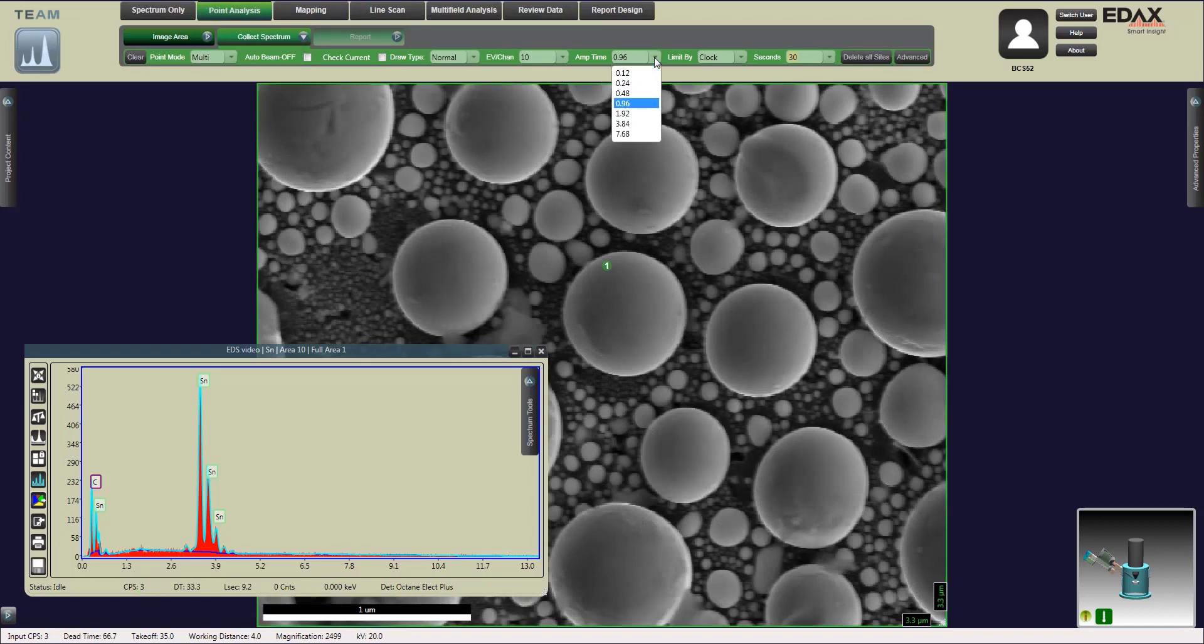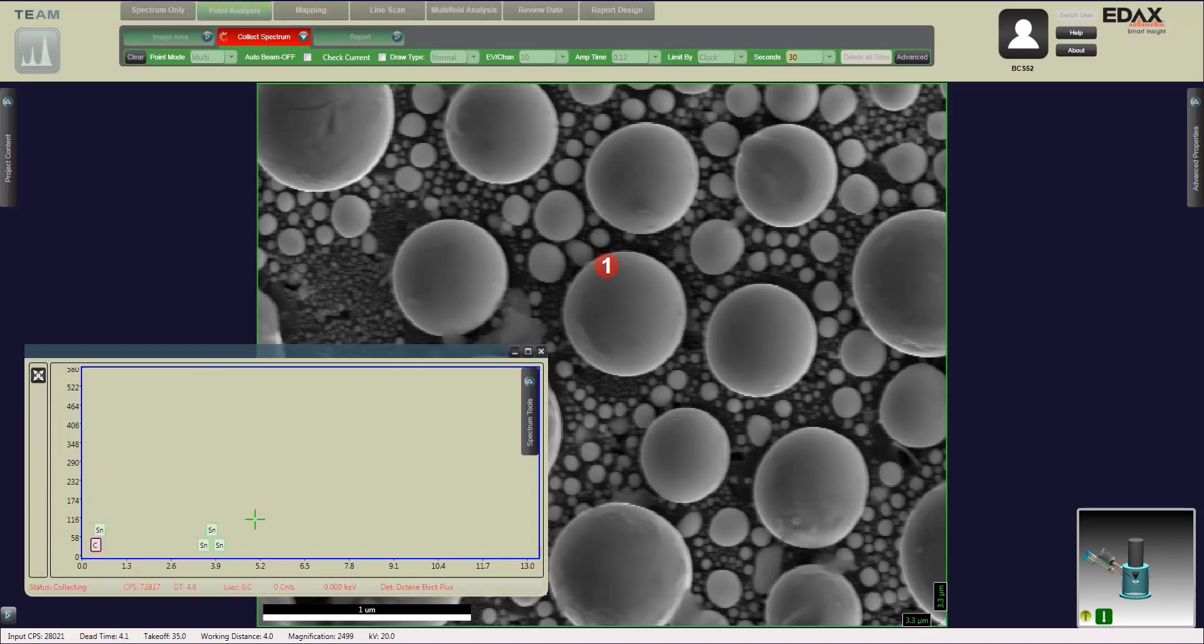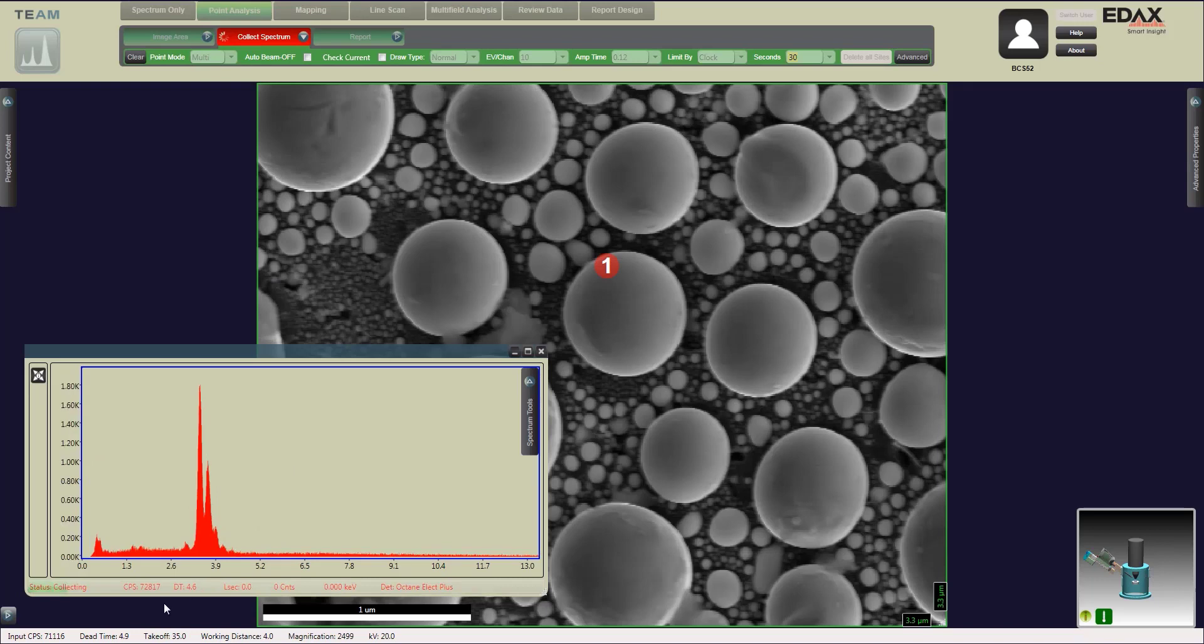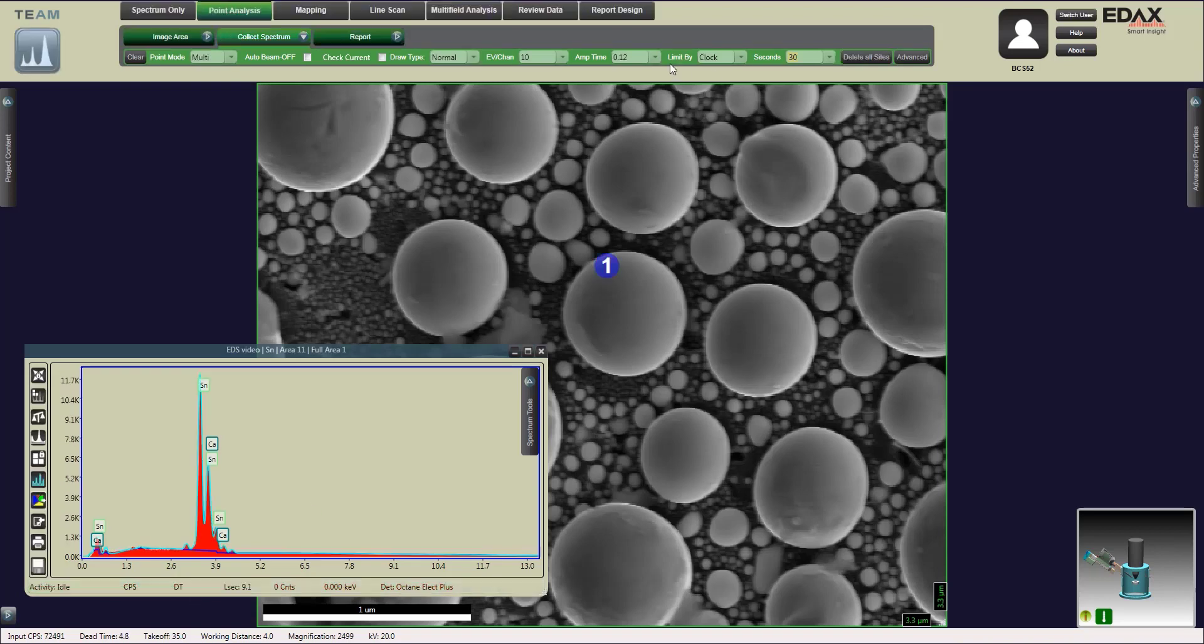Once we get our counts just how we want it, we're going to adjust the amp time to get the dead time correct. The dead time right now we're sitting right around four, and we want to increase that to anywhere between 20 and 40. Optimally we're shooting for about 30% dead time.